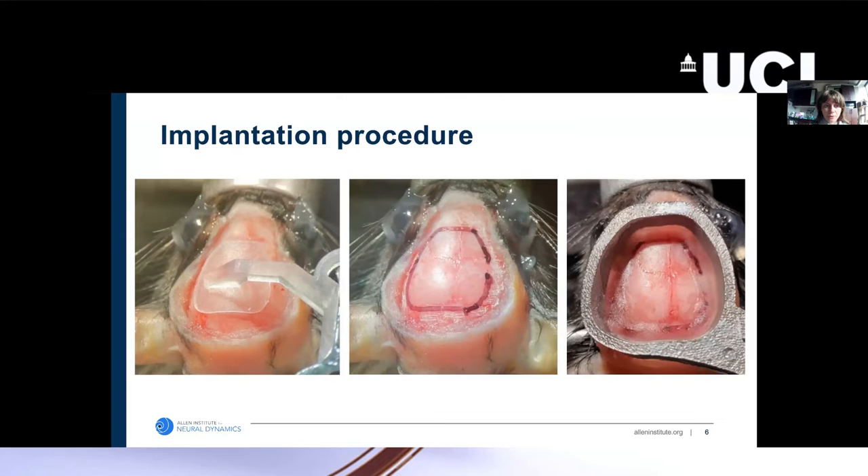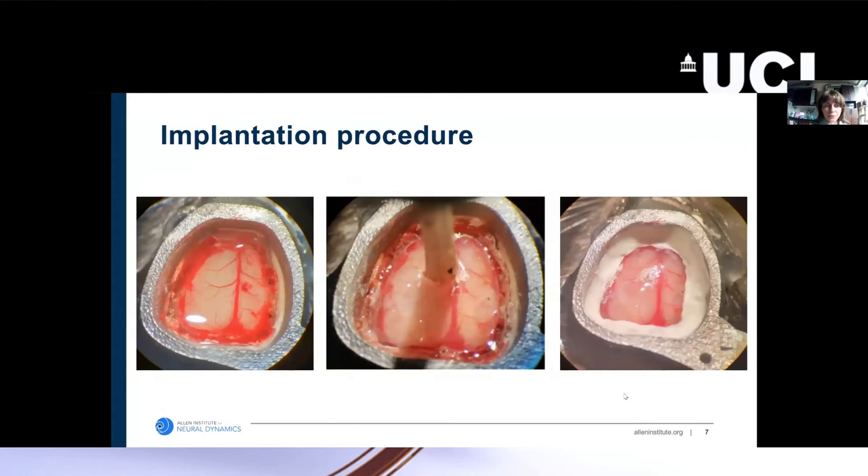For the implantation procedure, once we remove the scalp, we have a tracer that we position relative to bregma for the mouse. We then trace out the outline of the craniotomy and score the skull around where the craniotomy is going to be. We cement the head frame into place, and then perform the craniotomy and durotomies. We perform two durotomies on both sides of the sagittal sinus because the dura is highly connected to the blood vessels there and we don't want to damage that. After that, we press the implant into place and cement it.